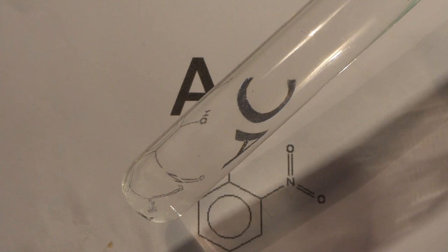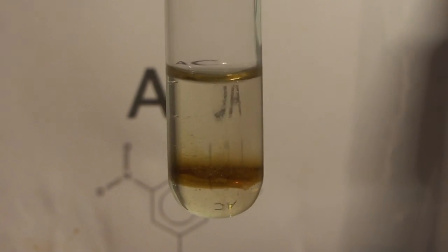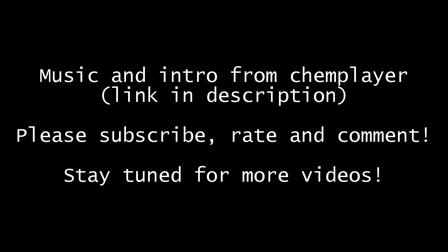Depending on the amount of nitrate present, you may have to wait a few minutes in order to see the reaction. Note, if nitrite ions are present, the whole solution turns brown after the addition of the iron(II) salt. After a minute or so, the very nice brown ring formed. Please note that depending on the concentration of your nitrate ions, the ring can be anything from faint pink to brown black. It is advisable to do a reference test. To do this, simply use plain distilled water and carry out the test as before.